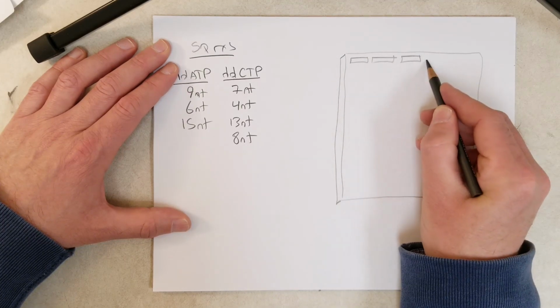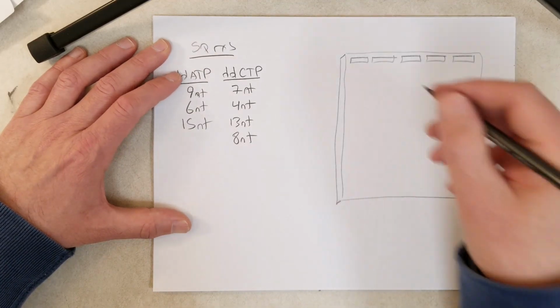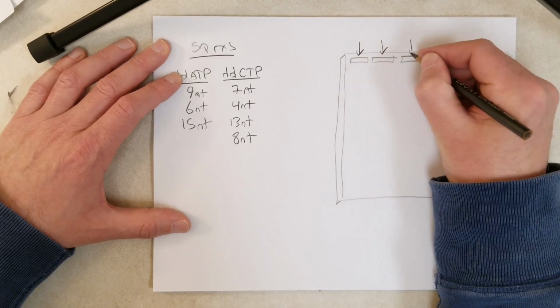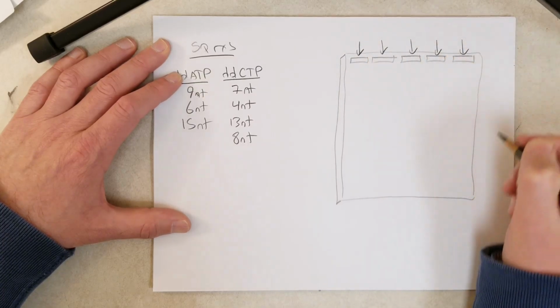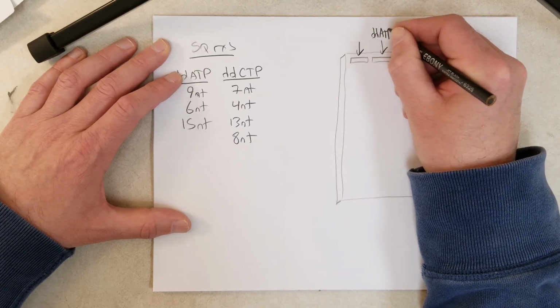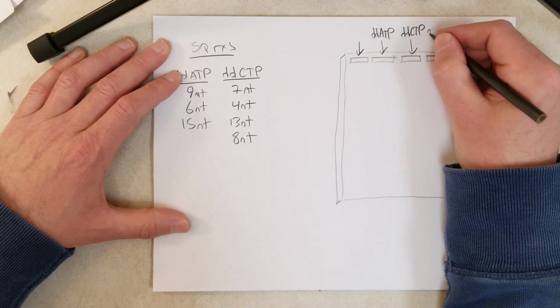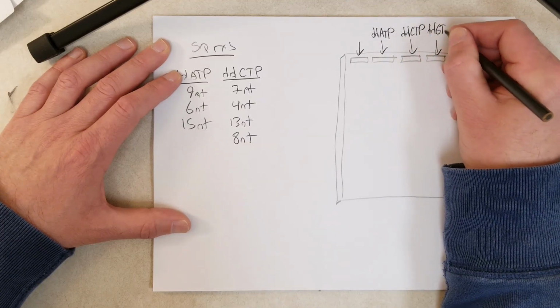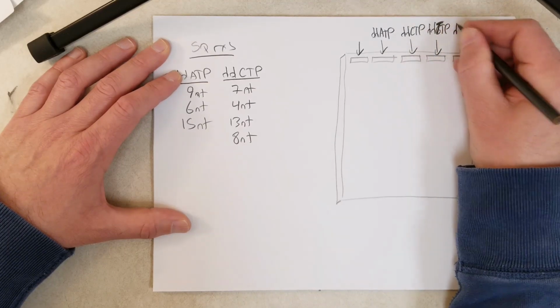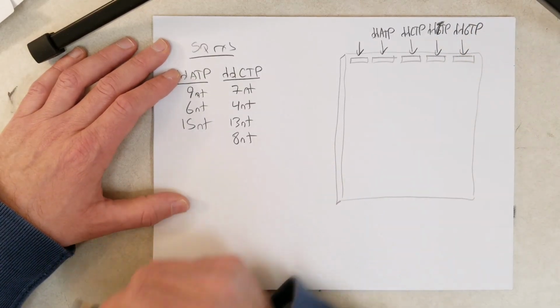So I'm going to put 5 lanes in here. And each lane is going to get a different sequencing reaction. So I'm going to put ddATP here. I'm going to put the dideoxy-CTP reaction here. And we also ran the GTP and the TTP. I'm going to put T right here, but we didn't go over them on a piece of paper.